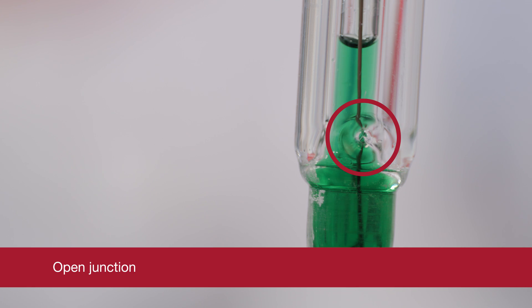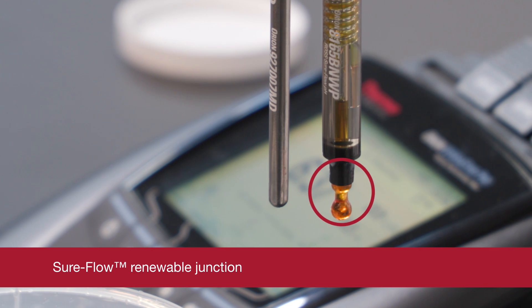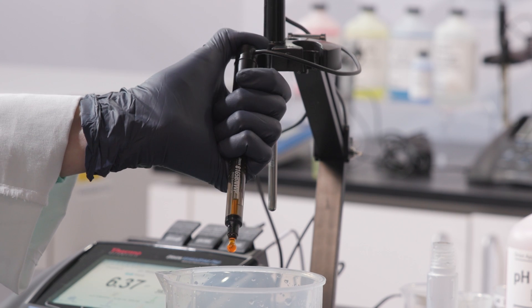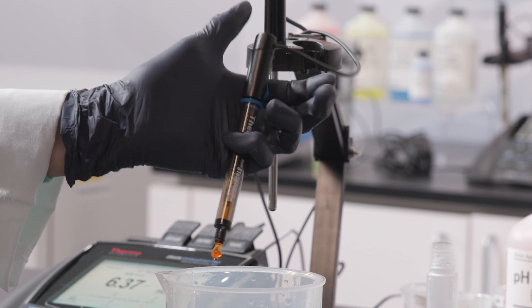Difficult applications require electrodes with suitable reference junction designs for improved performance. Open, capillary, renewable, or flushable junctions are preferred. These designs allow for good electrolyte flow and fast response. In addition, they resist blockage and are easy to clean by rinsing or flushing.